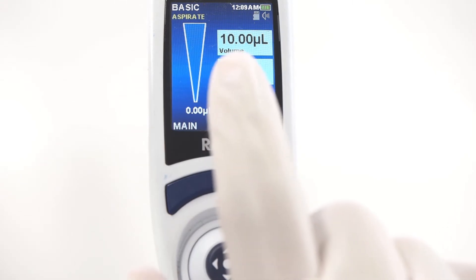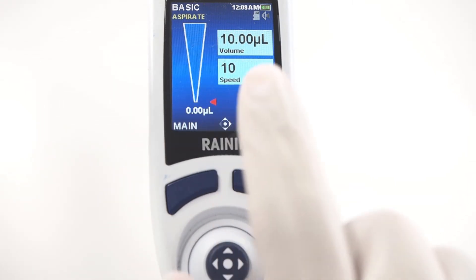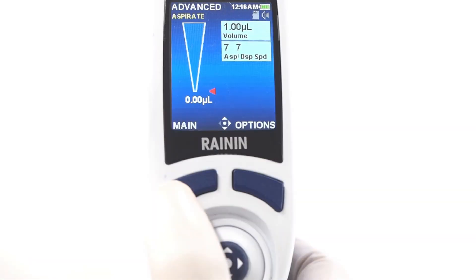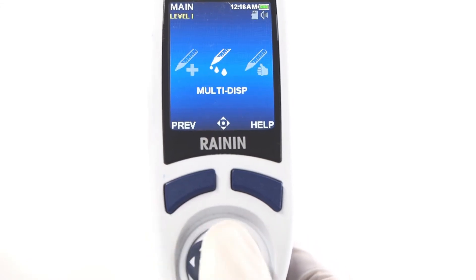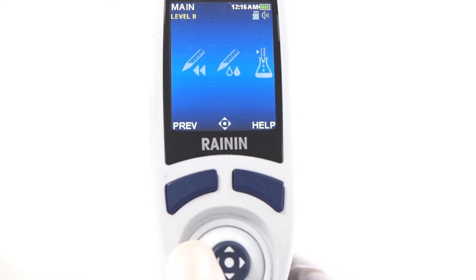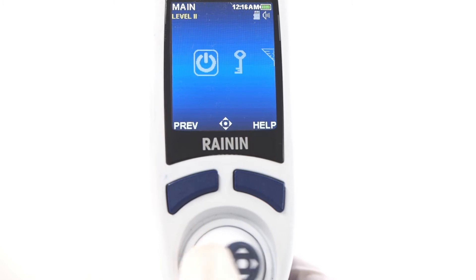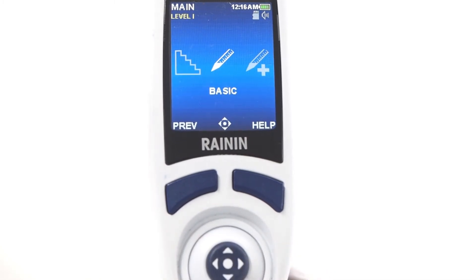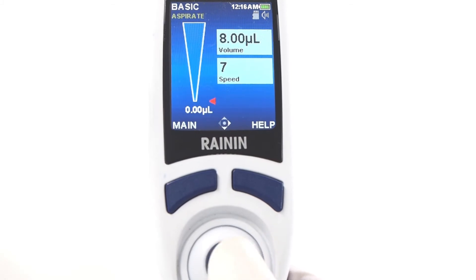Settings are on the right. In basic mode, settings include volume and speed. To navigate settings and options and to operate the pipette, use the joystick. Press main and joystick to cycle through the two levels of modes and other selections. Press the joystick up to make a selection. You can also press the joystick in to make a selection.